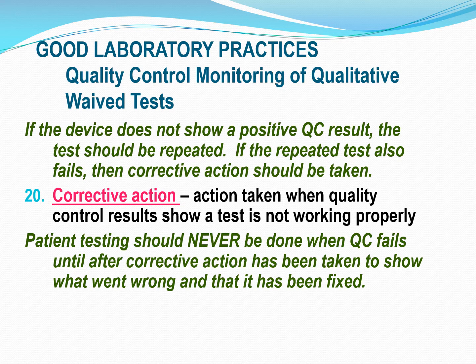The very first thing you always want to do is repeat it, because it's first thing in the morning, maybe you didn't get enough sample in there, anything could be going on. It could have been a user error where you just missed one little step or didn't do something right. And instead of trying to do a whole lot of other stuff, the very first thing is just repeat it. Because a lot of times you do that and you get the right result and you move on from there, okay?